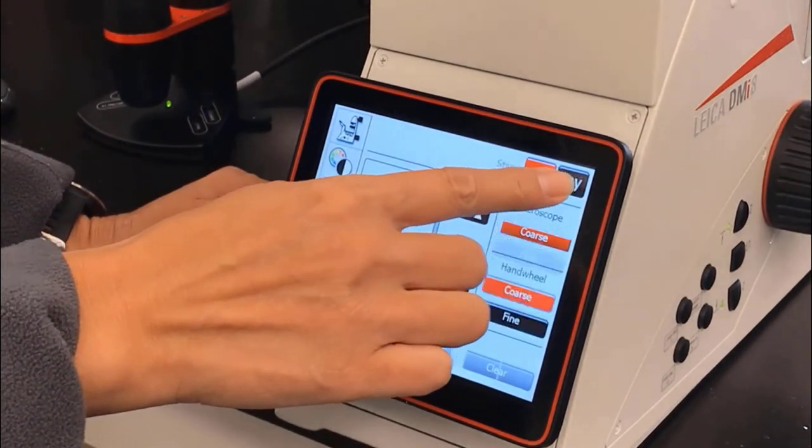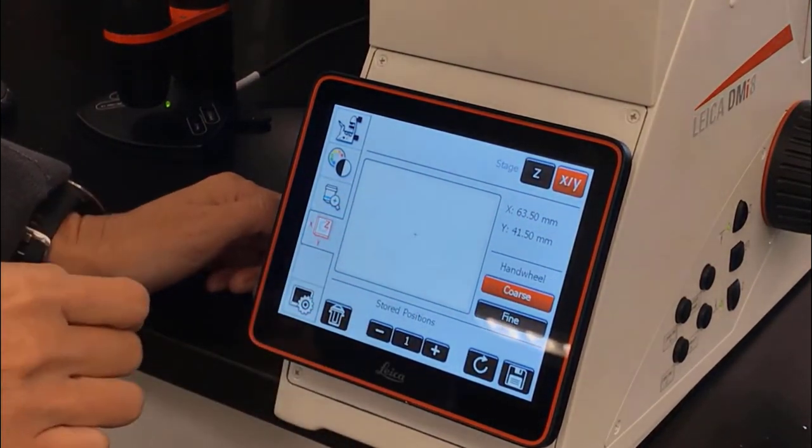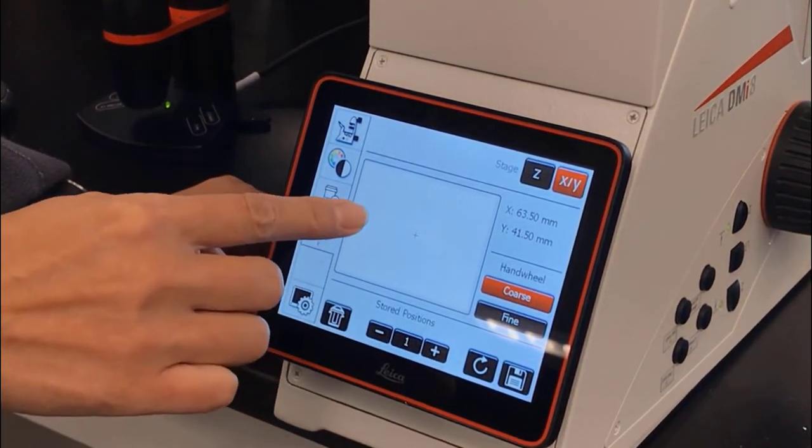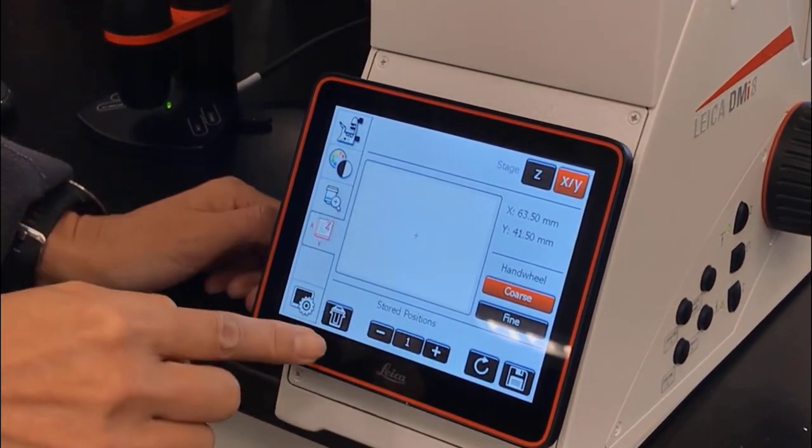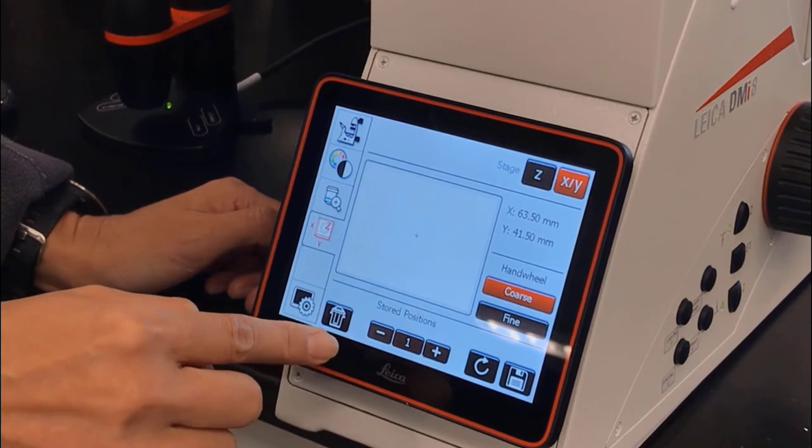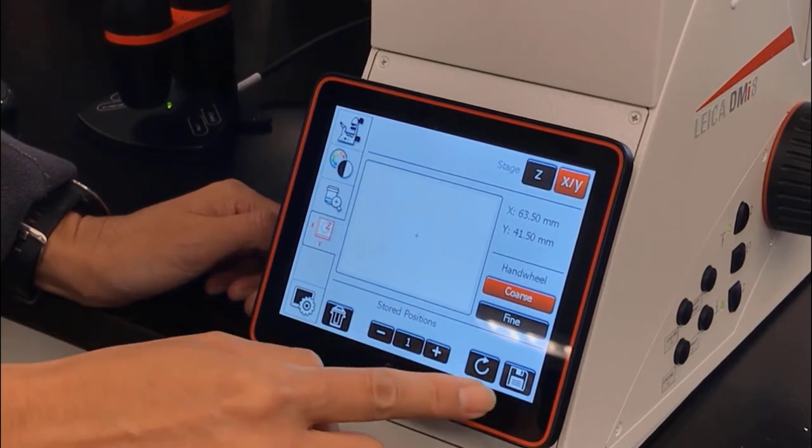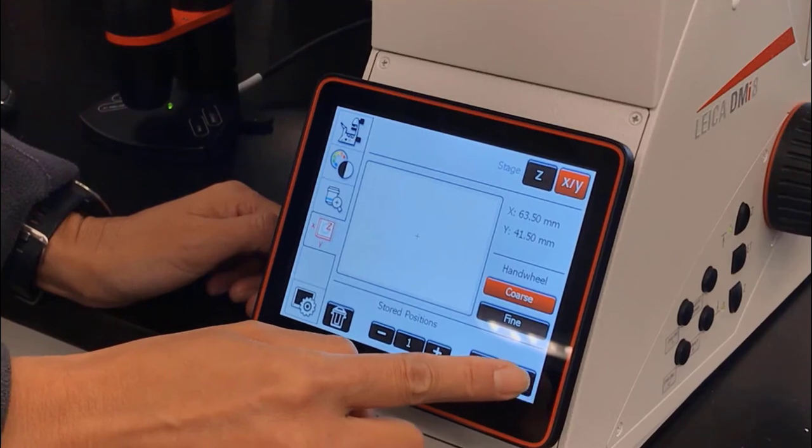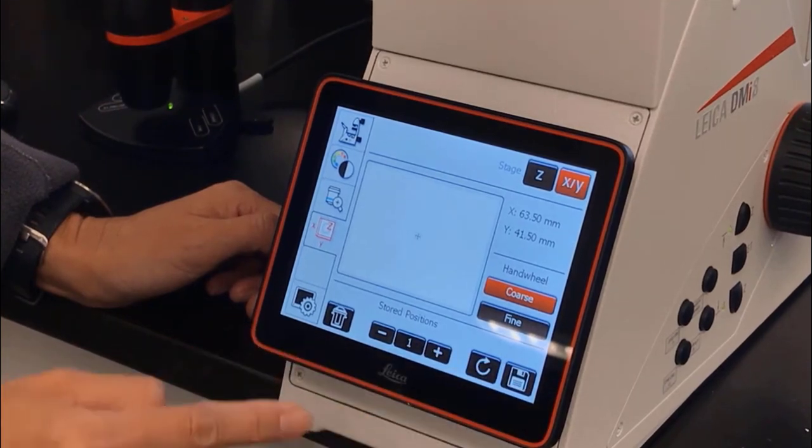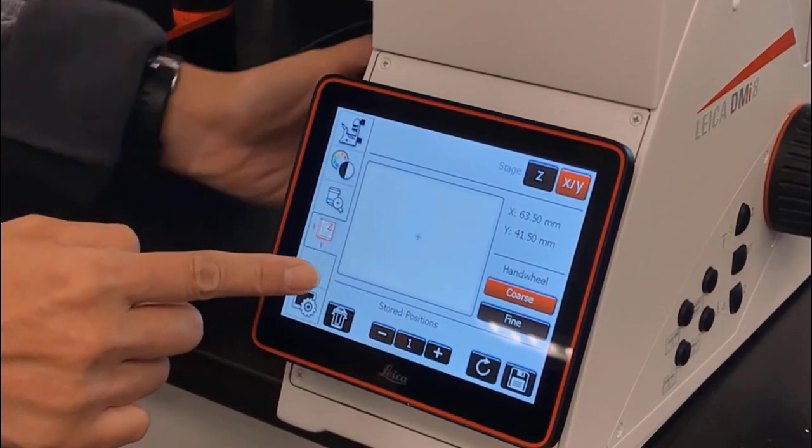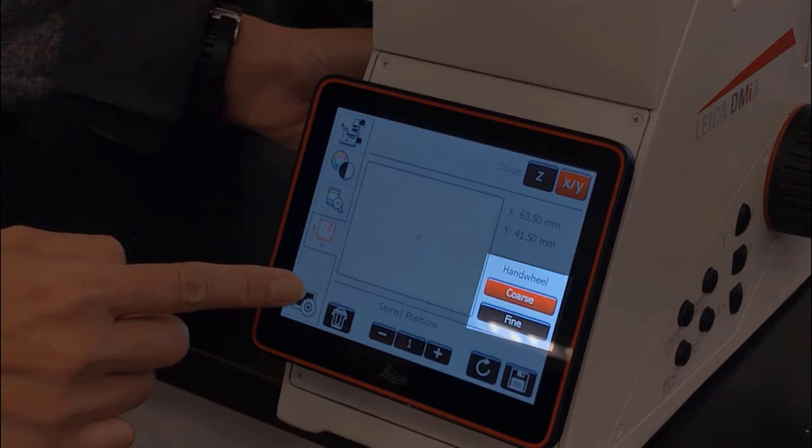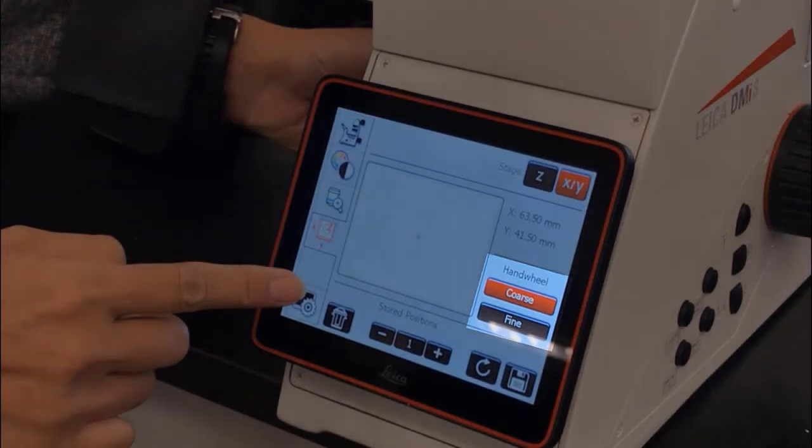The last tab is X, Y, which you can use to store stage positions. To store the current stage position, touch the floppy disk icon in the bottom right hand corner. You can revisit the positions with a circular arrow icon. You can also toggle between coarse and fine handwheel speed.